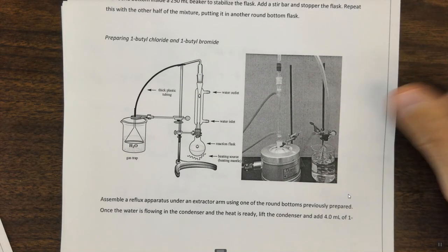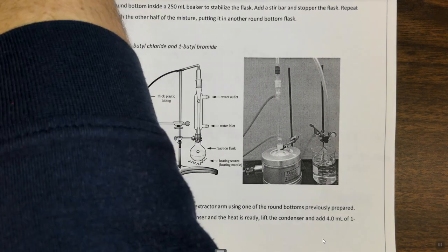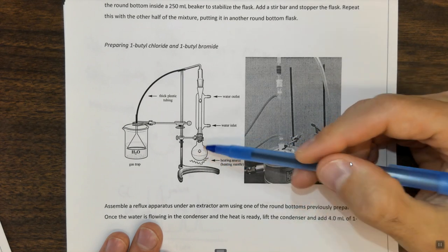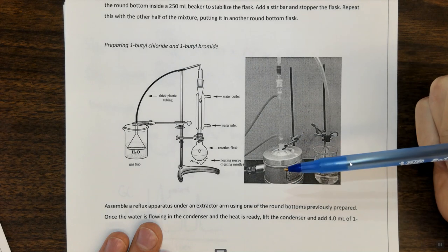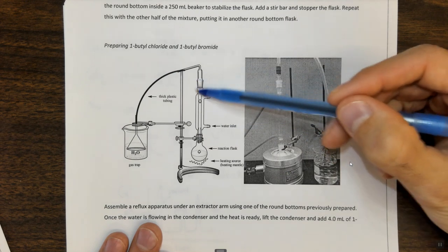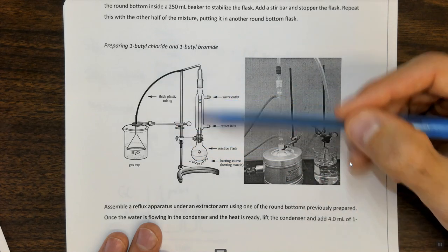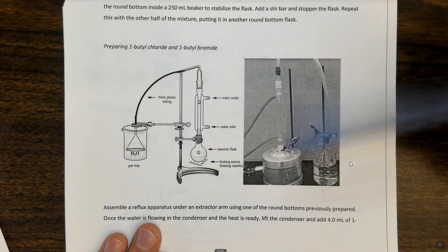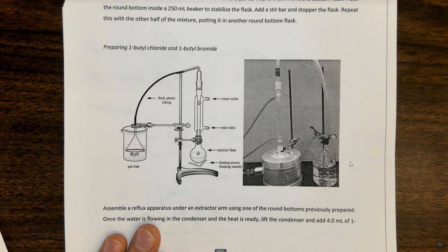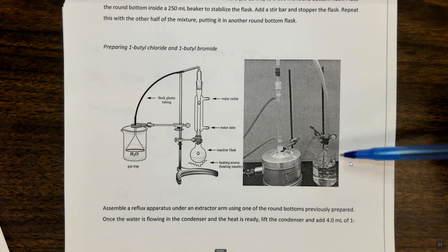mixture. And I want to show you a picture. So basically, what we're going to do is add about half of the nucleophilic mixture to the round bottom flask. Then we're going to set up this gas trap apparatus, which looks like this. So you're going to have a condenser with water in and water out. But instead of just having this open to the air, you're going to run it through a gas trap so that if any hydrochloric or hydrobromic acid is formed, it'll get trapped here and it won't go into your breathing space. Here's a diagram of it, and here's what it looks like in real life. So make sure you have this gas trap hooked up before you start your reaction.